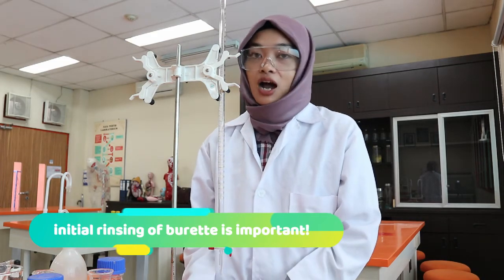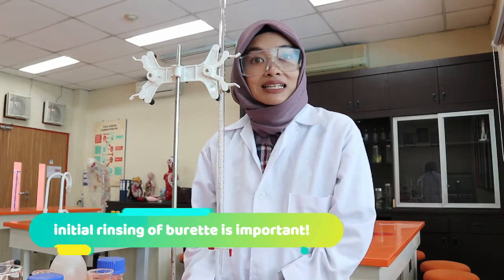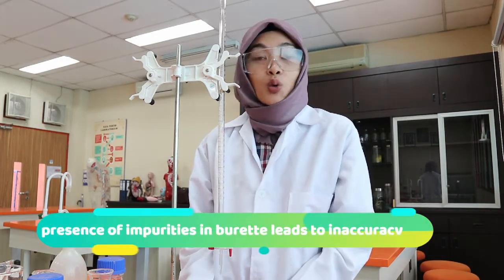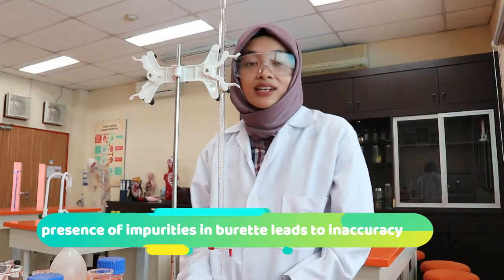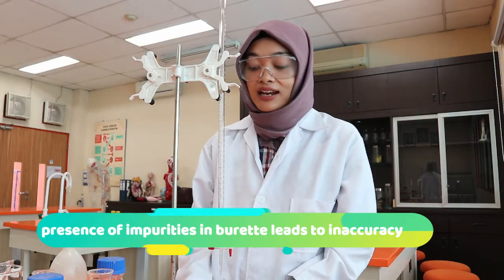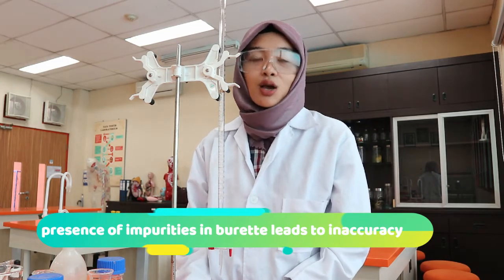Those impurities will alter our results. For example, if this burette was cleaned and rinsed with water but it hasn't dried completely when we use it, then that water will dilute whatever solution we're going to put inside. When dilution happens, whether it is on purpose or it isn't, the concentration of the solution will change.